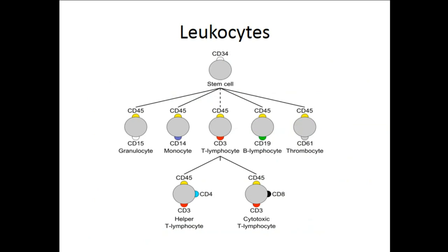I'm going to take you through how this process is undertaken. So we did the ELISA last week. One thing you should have taken from the ELISA is that we have the potential to create antibodies that can bind to specific proteins. Okay?